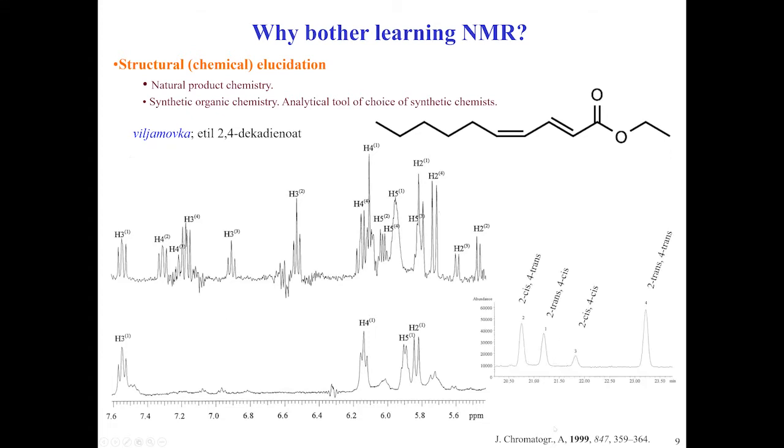They were chromatographers and they didn't have standards. So they came to me, and at that time through NMR, we were able to show them exactly that we have this cis trans and so on and so on. So this is a little example. Of course, we did more, but to tell you the truth, the biggest challenge at that time was that, of course, any drink, it's mostly water.